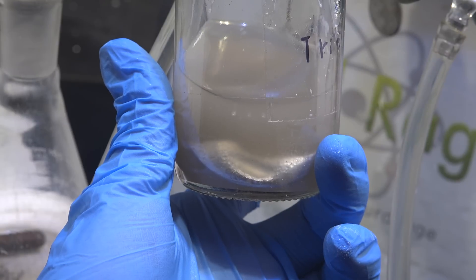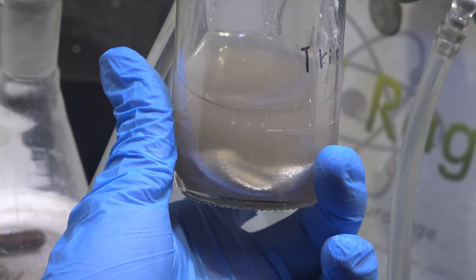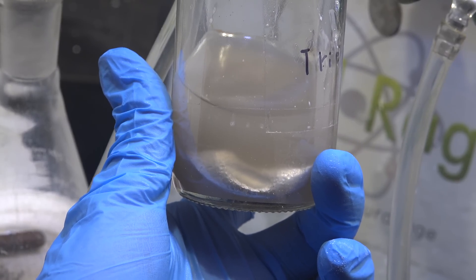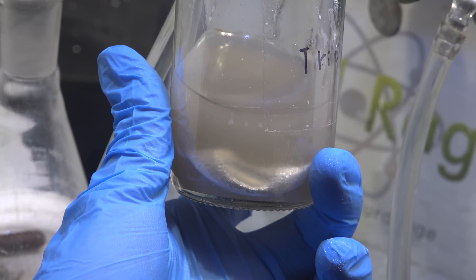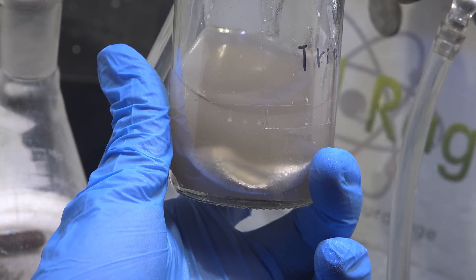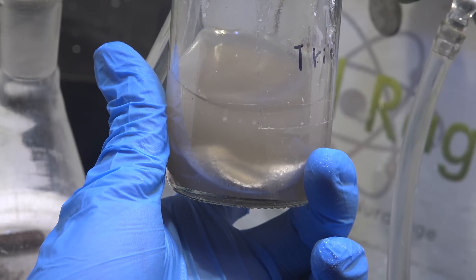Here we are about four days later. You can see there is no more bubbling, and the continual hammering by the stir bar has knocked off the crust and made our sodium shiny. The fact that it remained shiny is a good sign that it stopped reacting to make a new crust.